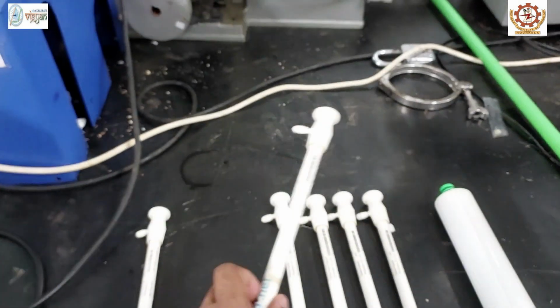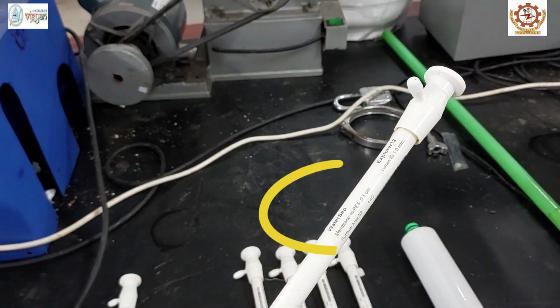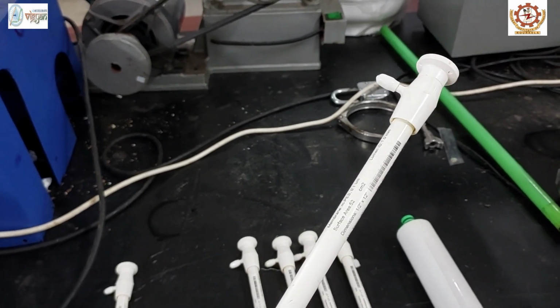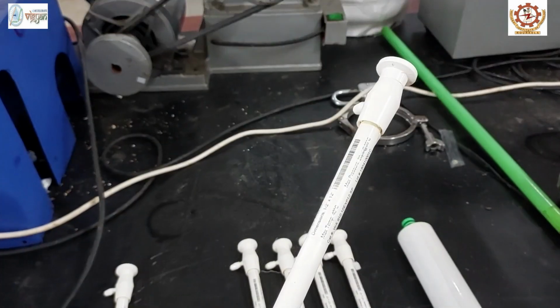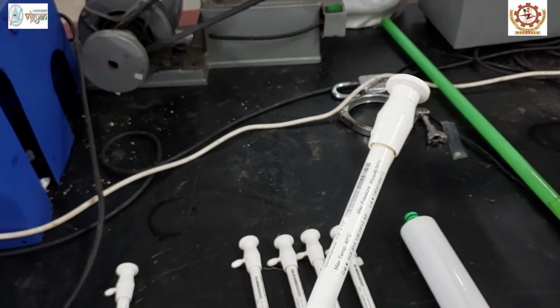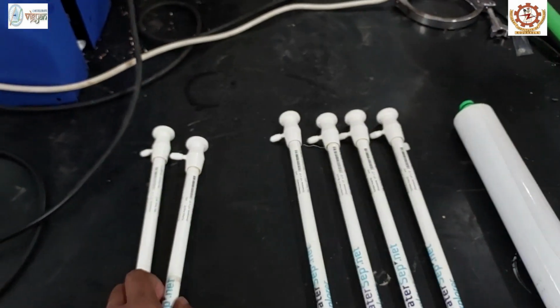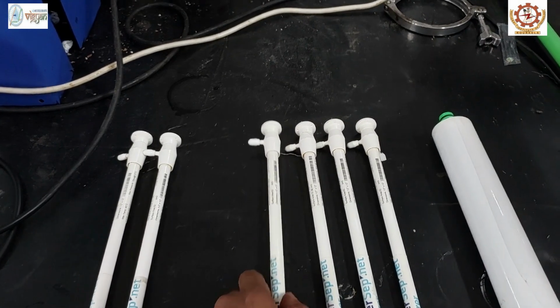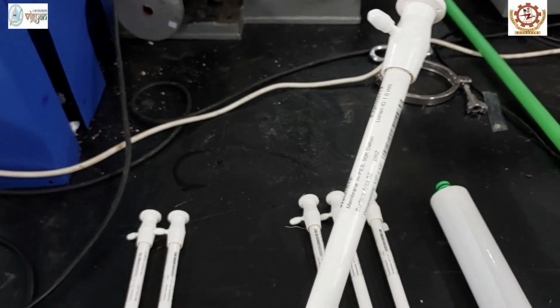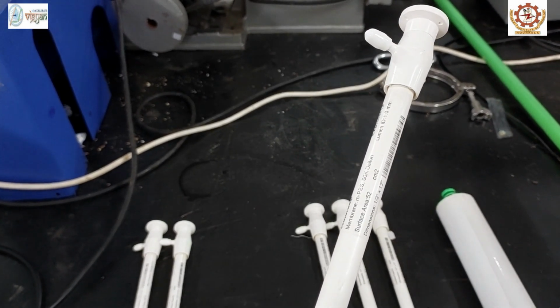Similarly, this is another microfiltration membrane with membrane pore size 0.1 micrometer, and the surface area, maximum temperature and pressure for this membrane are similar to those of the 0.45 micrometer membrane. However, this is an ultrafiltration membrane whose membrane pore size is 50 kilodalton.